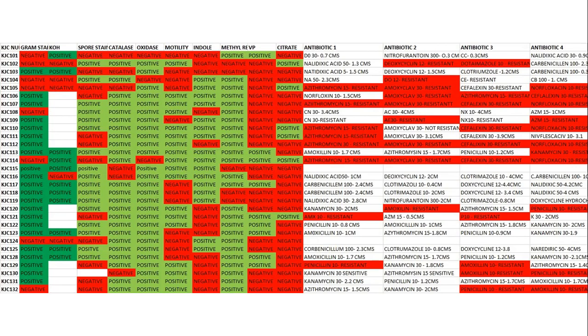One of my activities is also culture collection. I don't want to sequence the same species twice. So I use this heat map along with the antibiotic sensitivity assay.